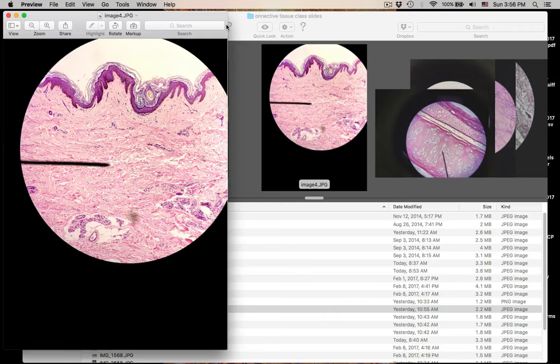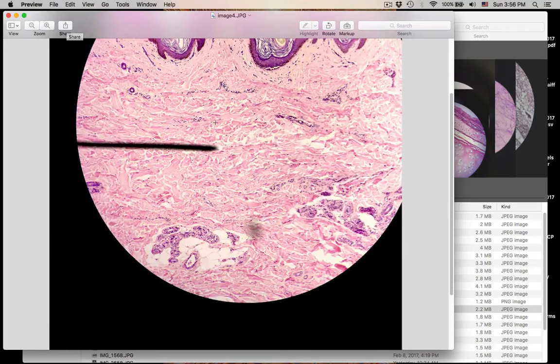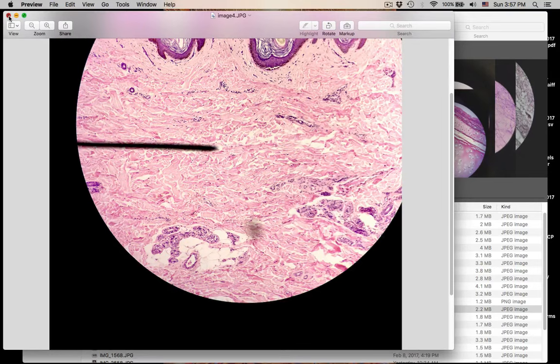Here we see another image. You should know this is from the skin. What type of connective tissue is this, and what layer — what region are we in? So what type of connective tissue is it, and what region of the skin is this? That was number thirteen.